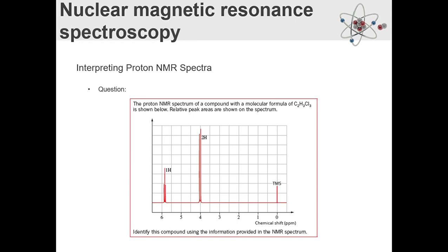Alright, so C2H3Cl3. What that means is, let's just take the first carbon. You can either have 0 chlorines on it, 1 chlorine on it, or 2. Sorry, that's actually right. There's only 2 different possible molecules that you can have here. Again, you can either have 0 chlorines on the first carbon, or you can have 1 chlorine on the first carbon. Otherwise, that would create, you can't go 2 or 3 because that would create a symmetrical molecule.